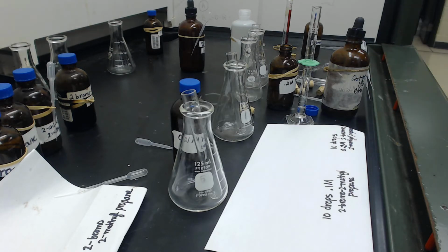All right, so now I'm ready to do the determination of the rate law. It's going to be a little tricky to do it by myself, so I decided to take the alternate approach. I'm going to do one at a time and record the time it takes for precipitation to occur. So we'll see if this works at all.